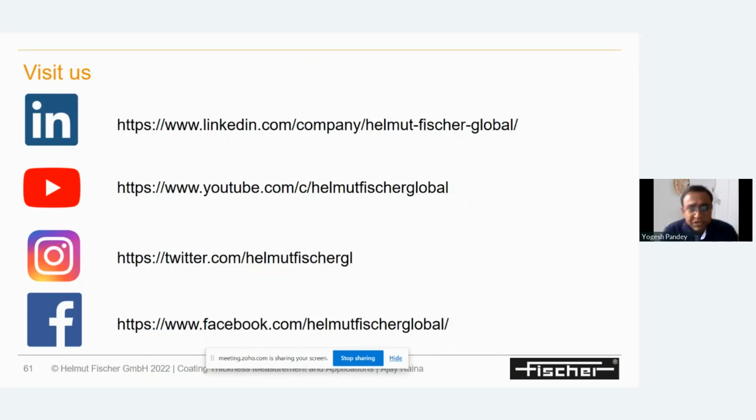At the end of this session, I ran some polls, where customers gave the right feedback, and on that basis I could say they have understood the basic things of the XRF machine, how it works, what parts are involved, and how those parts play a role in the selection of an XRF machine as per their application. So I think it was well enough, sir.